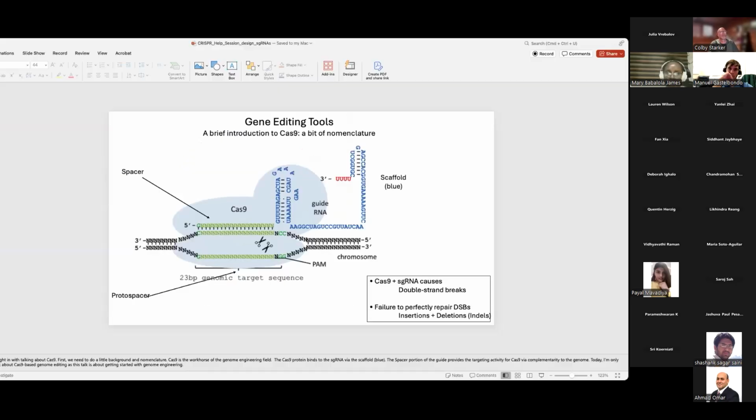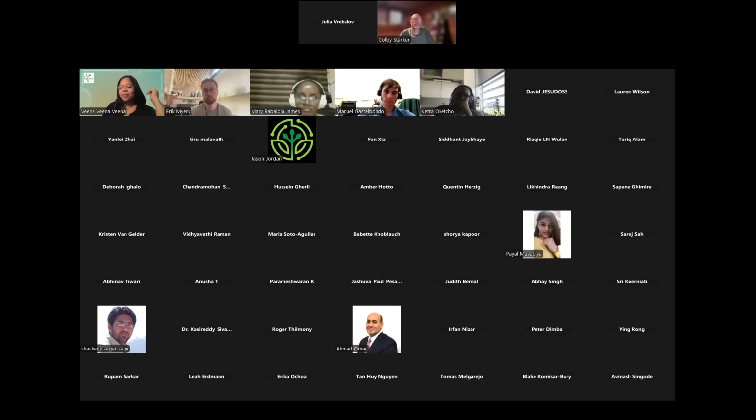To all who are attending, please note there are no silly questions, so feel free to think about your question, write it in the chat, and also raise your hand. I'm going to go with the question posed by David: why must all guide RNAs start with G?